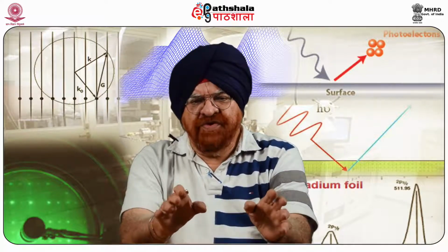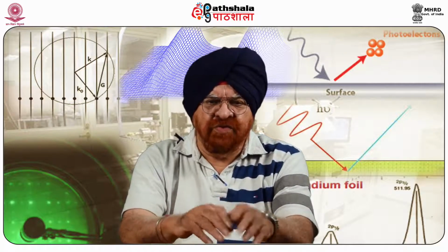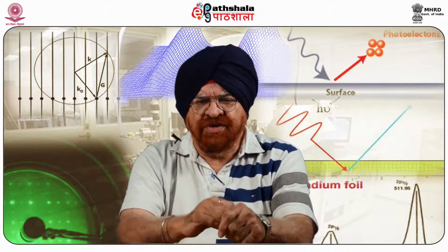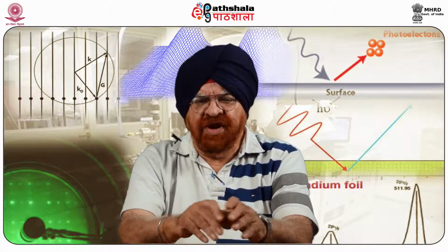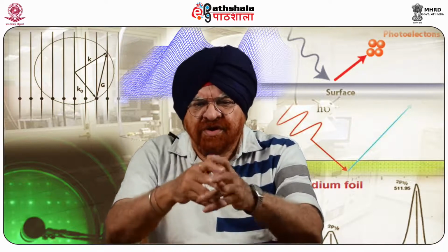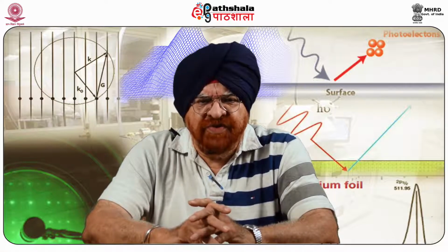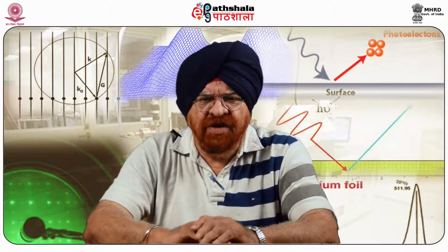High resolution KPFM has been used to probe semiconductor devices also. When we try to list the applications, we find that it is being used in a variety of areas and surfaces where research is important. A notable application of KPFM is the imaging of operational electrical devices to provide high resolution potential profiles.